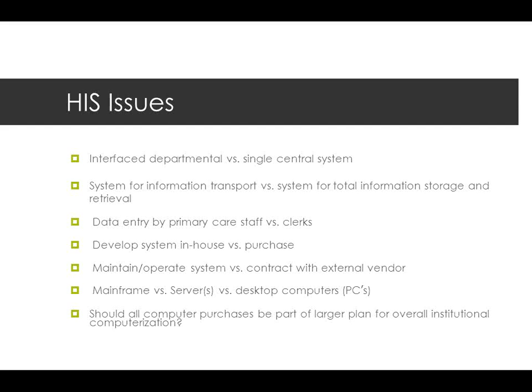Were you going to develop the system in-house versus purchase it? And there are still some places that are still in-house. Marshfield Clinic is entirely home-built. Their entire EHR, their lab system, their radiology system, everything is entirely built and owned by them. You hardly ever see that anymore. Were you going to maintain and operate the system or contract with some external vendor for that?